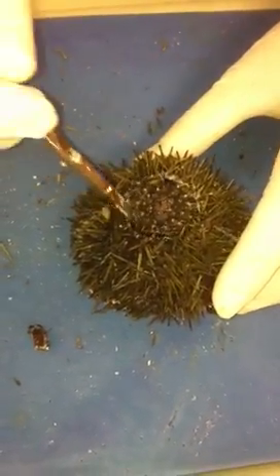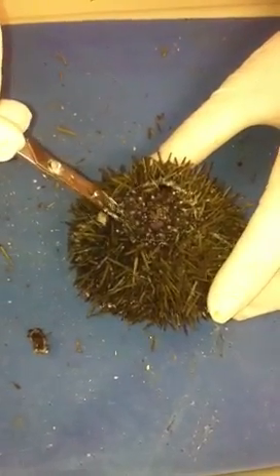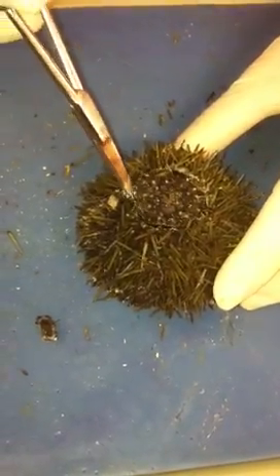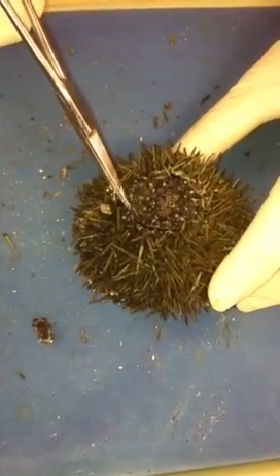In order to open up your sea urchin, what you'd like to do is insert your scalpel. It will take a little bit of pressure. Once you've inserted the scalpel, you're going to use your scissors and insert it into the hole that you've created with your scalpel.